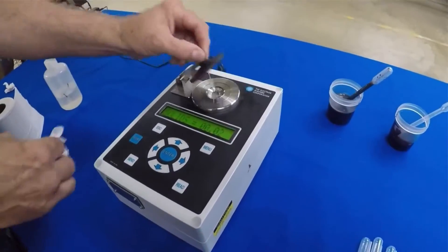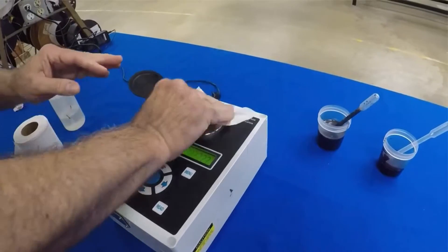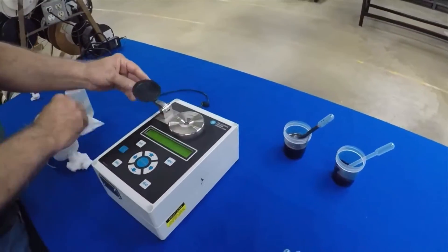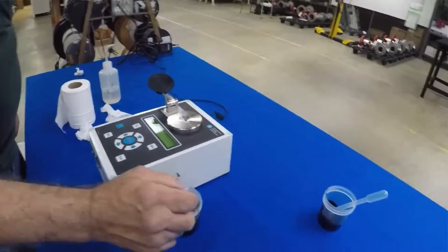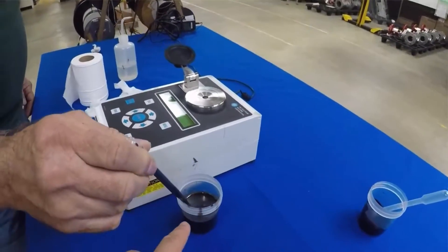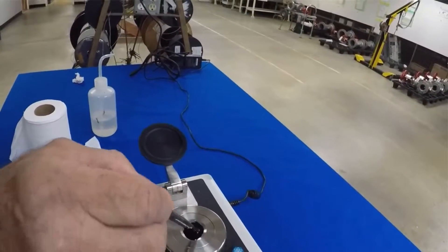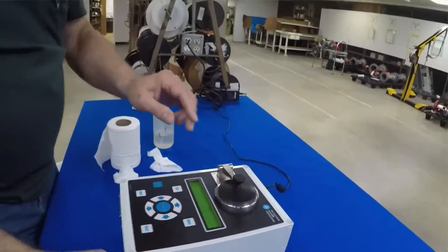First you need to clean the water off. Simple paper towels or toilet paper — you want to make sure it's nice and clean, there's no extra water on there. Then you're going to take your black liquor. We have two different varieties today. I believe this is a weak liquor sample.